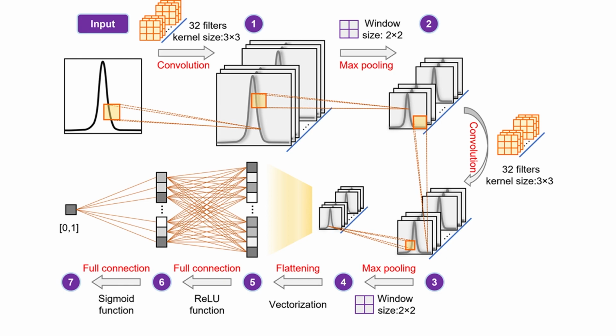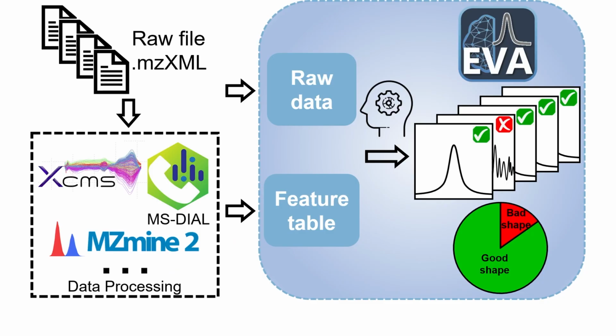We aim to streamline this process using a user-friendly program running in Python. In this video, we will cover how to download pyEVA, the installation process, and how you can use it.